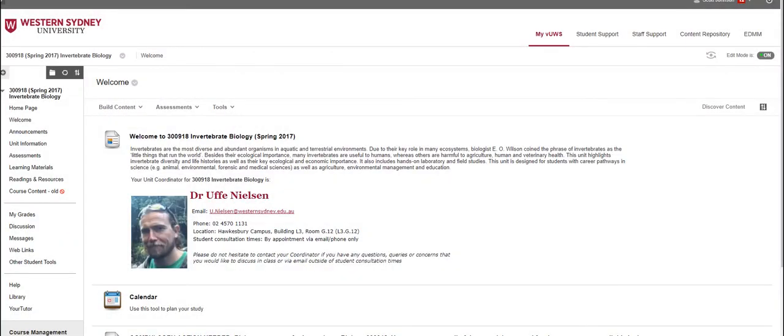Today I'm going to show you how to access the data files from the experiment that you harvested on Monday the 21st of August. These are the data that you'll use to write your experimental report. So first of all, log on to Views.